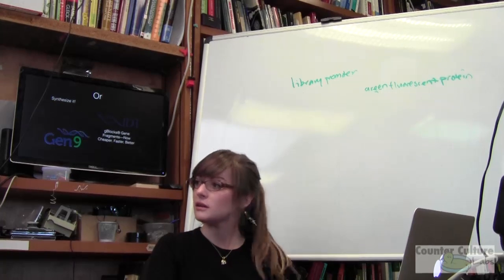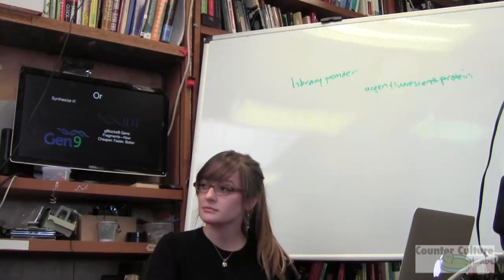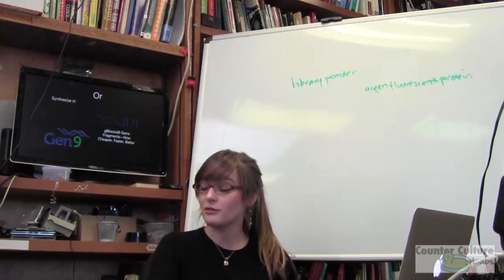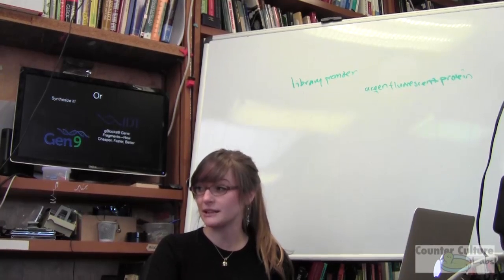Question on the vectors. How does the shipping work? Does it come frozen? Is it suspended in some liquid? Is it just a little bit of agar and it's cool? It's typically lyophilized, meaning it's a dry powder form of your DNA. It's not resuspended in anything.